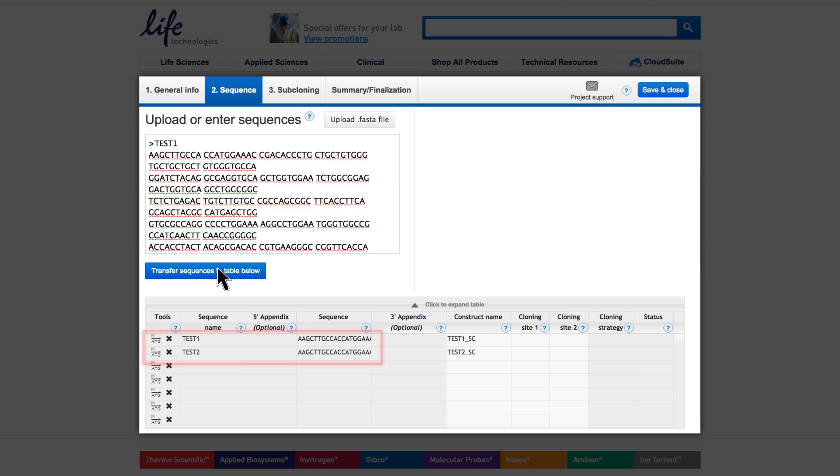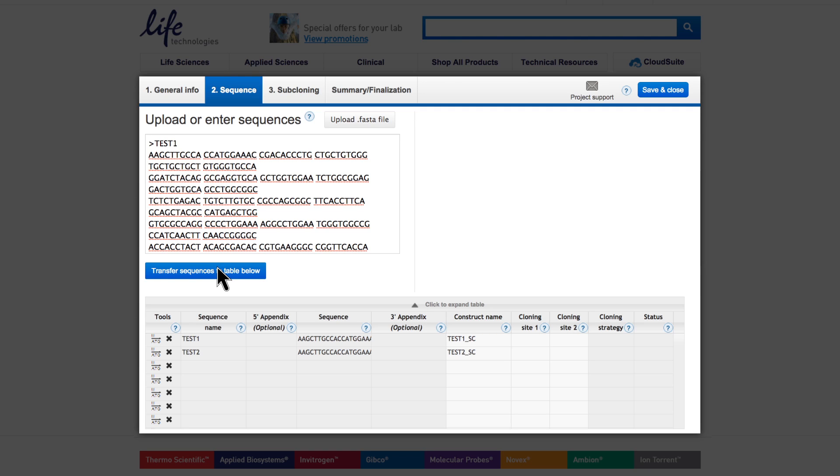If you have selected subcloning, a name for the subcloned construct will be automatically added, which can be edited later. If you want to optimize your gene, you must fill the sequence field with only the coding sequence. Consider this too when uploading or entering FASTA sequences. If entering protein sequences, you must use an asterisk to indicate your stop codon.